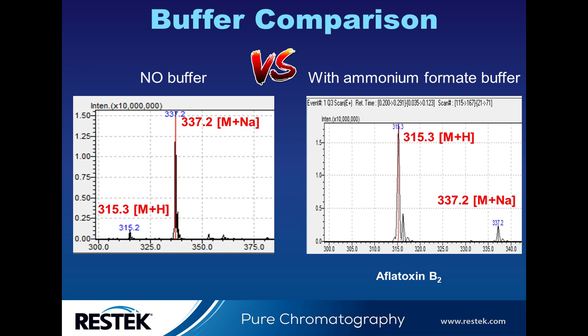I should remind you that this is the case for most of the mycotoxins, except for HT2, T2, fumonisin B1, B2, B3, and ochratoxin A, where there is no big difference between buffer and no buffer. If you are experiencing the same situation or you are having problems in seeing your parent ion, you can probably try this method. It also has been reported in other literature too.